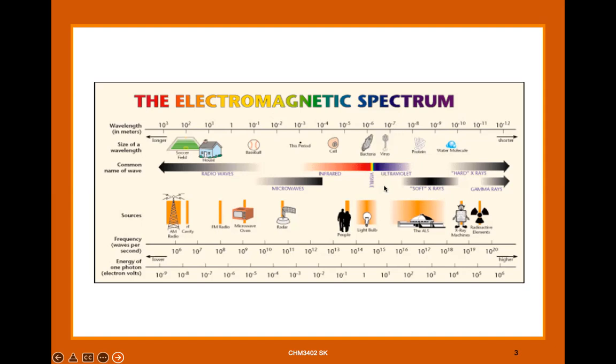So we have discussed atomic absorption, and then the problems, the sample preparations, and some interference in terms of getting good accuracy. And we also have discussed emission, right? Emission spectroscopy. And we have discussed that emission is more robust, okay?